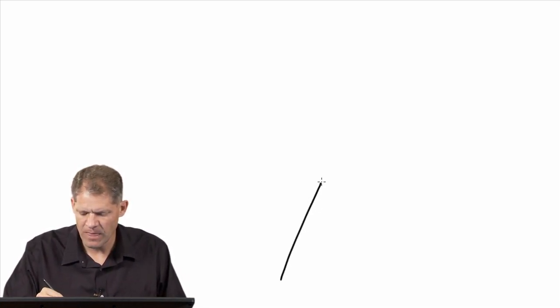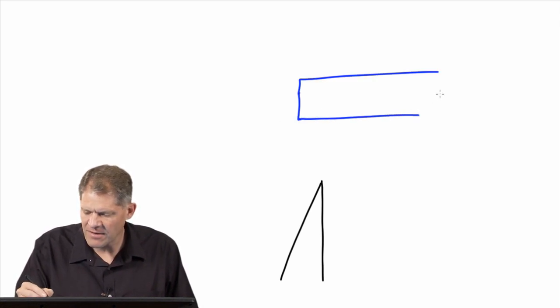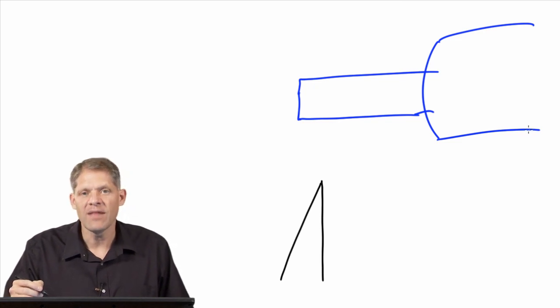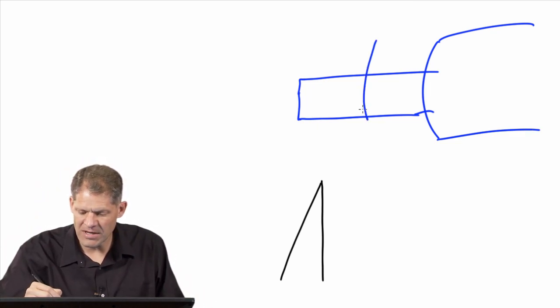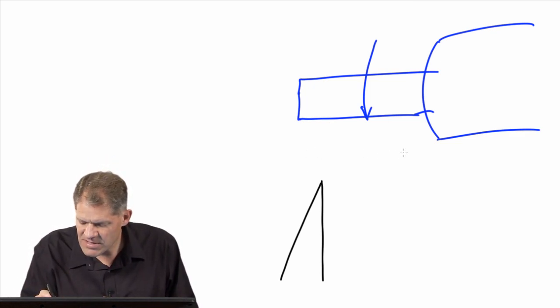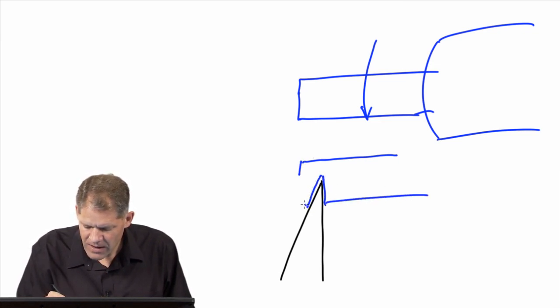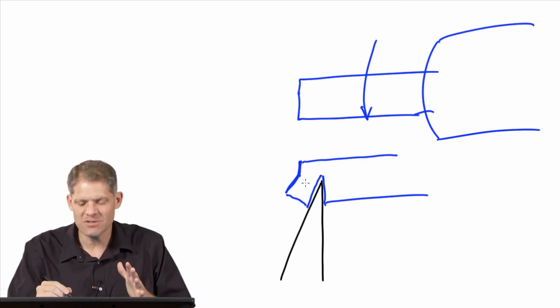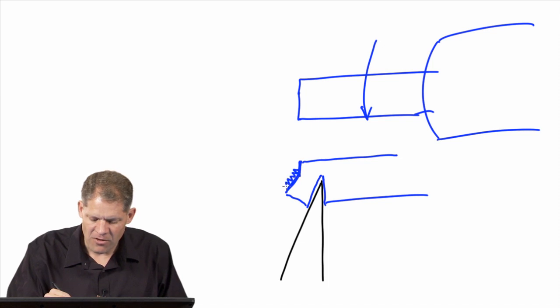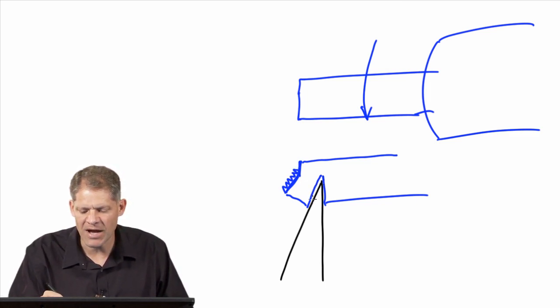A final problem arises because of the geometry of the cutting situation. Imagine that this is the diamond knife, and the material to be cut is above that knife, mounted into the chuck of the microtome, and this microtome arm is swinging up and down in front of the diamond knife. As it swings down into, say, this position, you can see that it will be cut by the diamond knife. However, the geometry of the situation creates stresses right here at the junction. These stresses force material to erupt up out of the surface, creating a series of ridges and crevasses on the side of the material away from the diamond knife blade.